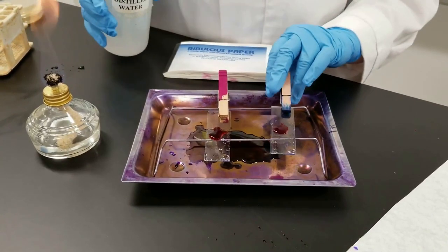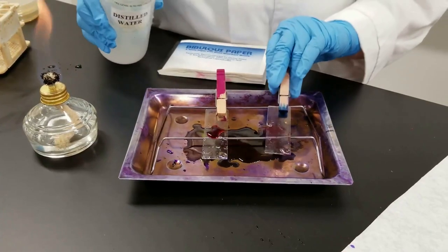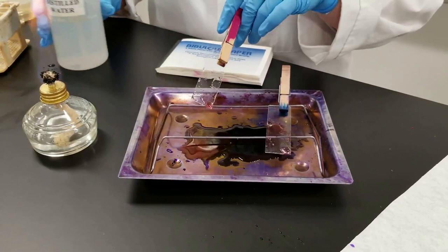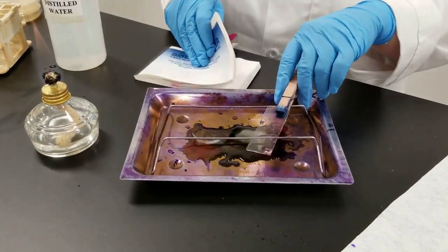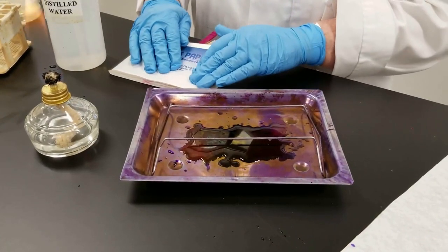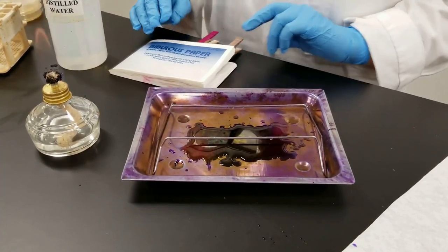So now we will rinse off this final step. And we will just blot them in the bibulous paper. Just be gentle as you do that. Let them dry for viewing later.